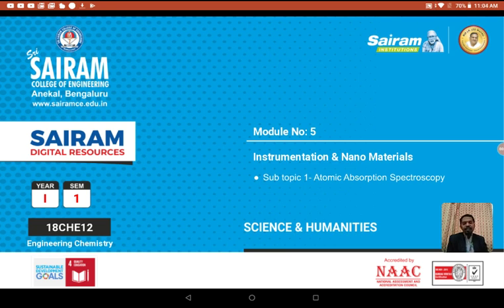So the basic principle is, when a solution having a mixture of metallic species is introduced into the flame, what will happen? The solvent will get evaporated, leaving behind the metallic species. Some of the metal atoms can be raised into a higher energy level, and they will emit radiation of a characteristic wavelength, which is what is used in the flame photometer. When the atom comes back from the excited level to the ground level, it emits some amount of light. If it is in the visible region, we are going to measure that.